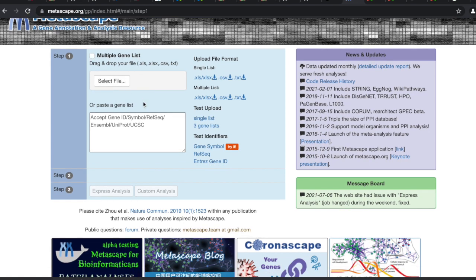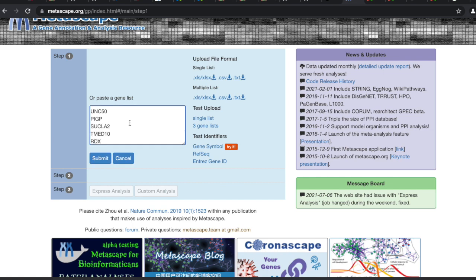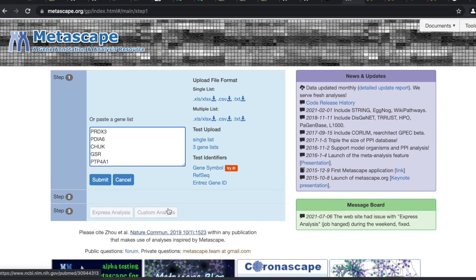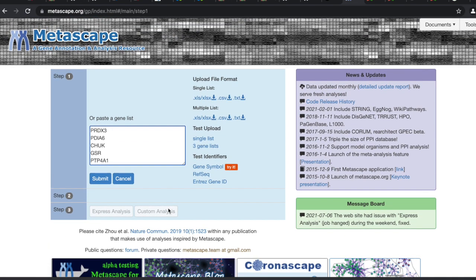So we can do multiple gene lists, but again, a lot of these software things, you just paste your list. So let's just paste that list that we had. I've got 200 and some genes in here. Ready to do that — now hit Submit.